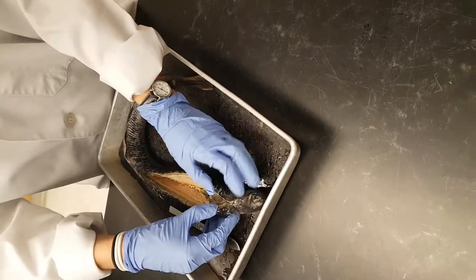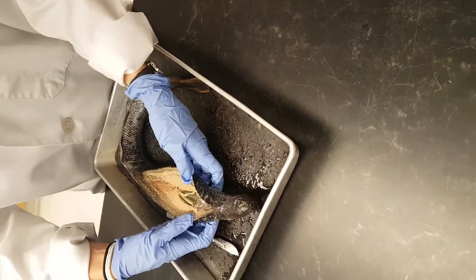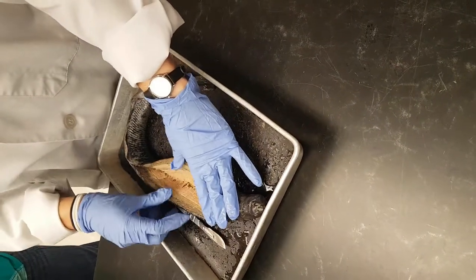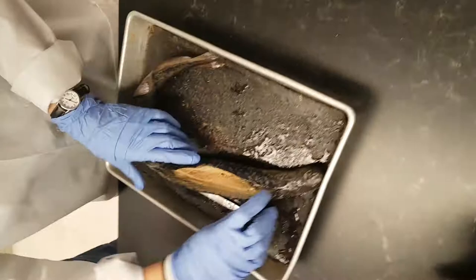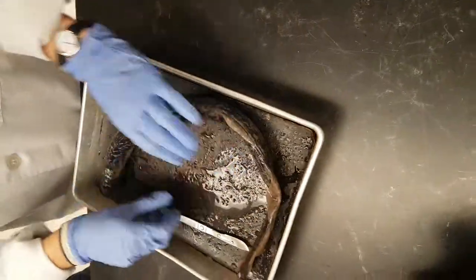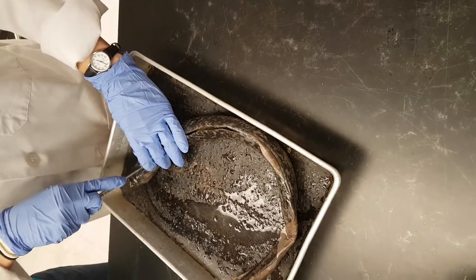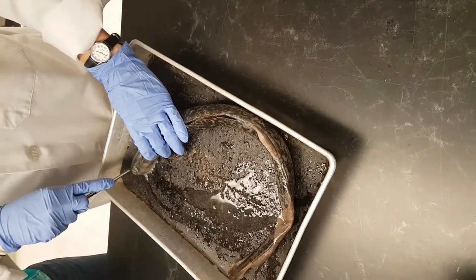I'm going to go all the way through there. Just right down the middle. And I'm going to flip it around, go back this way. This way we can see the brain.